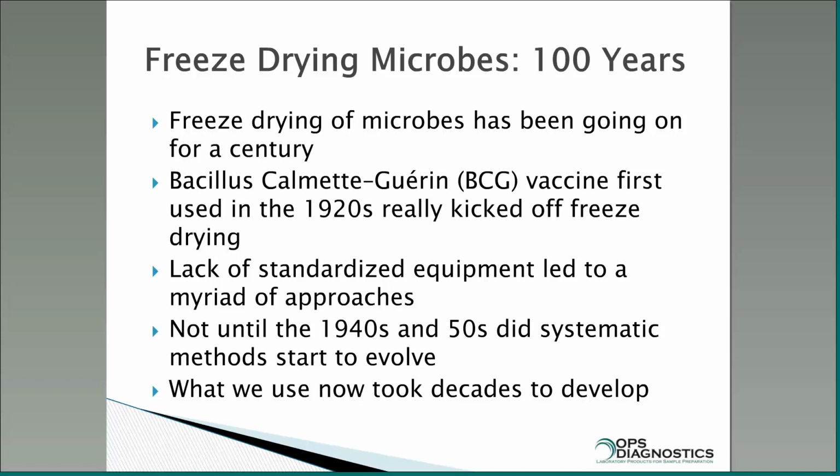But it was in the 40s and the 50s that people really started to systematically look at the way freeze drying worked and come up with instruments or processes that could then be commercialized. And that's when you really started to see a lot of culture collections being developed, and a real progression of the whole technique.